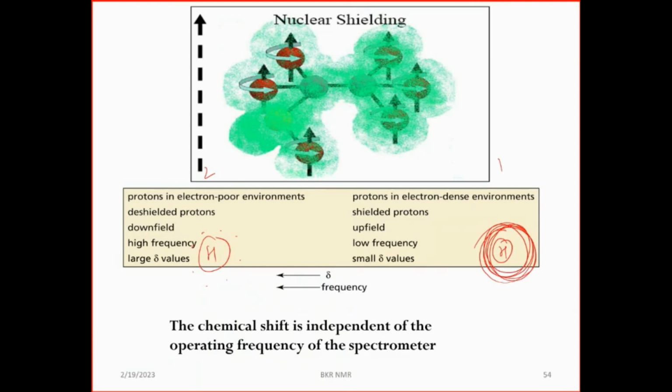So there are two types of spectrometers. I have the modern one and the old-time, traditional spectrometer. Now we have the modern spectrometer. So I have two types of sweep, which I say are field sweep and frequency sweep.